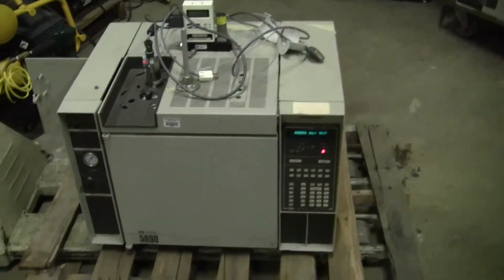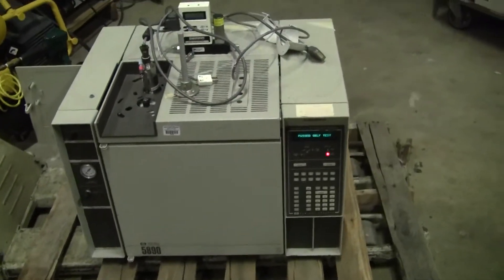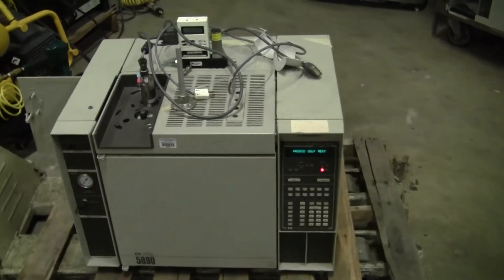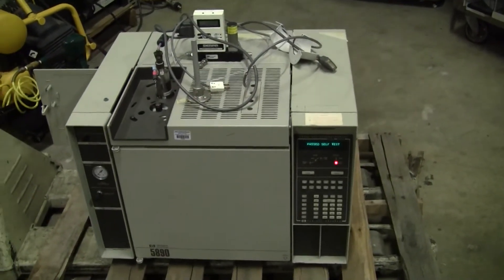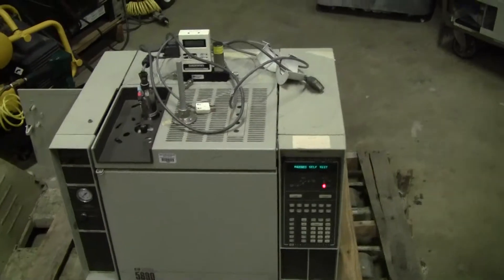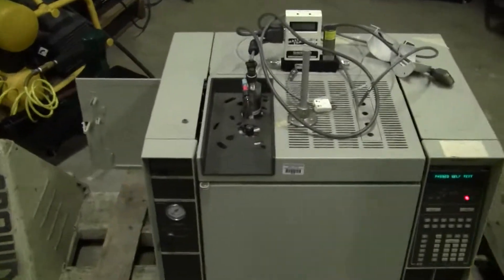Hi, this is Michael Naitow from Hitech Trader. Today we're looking at a 5890. The detector on it is a TCD.